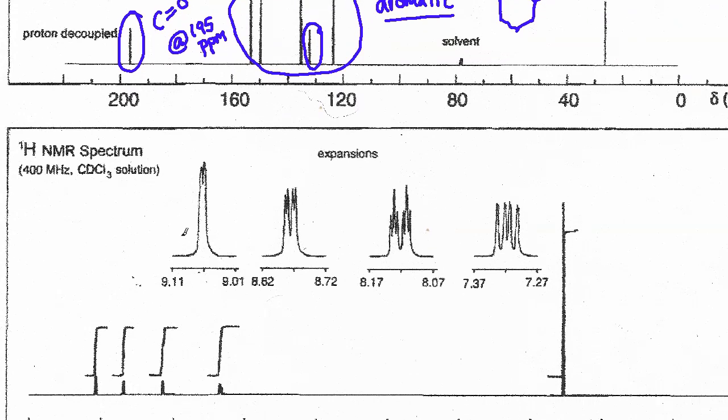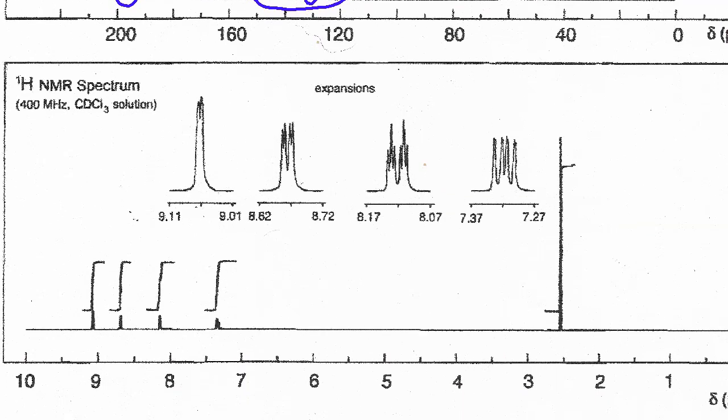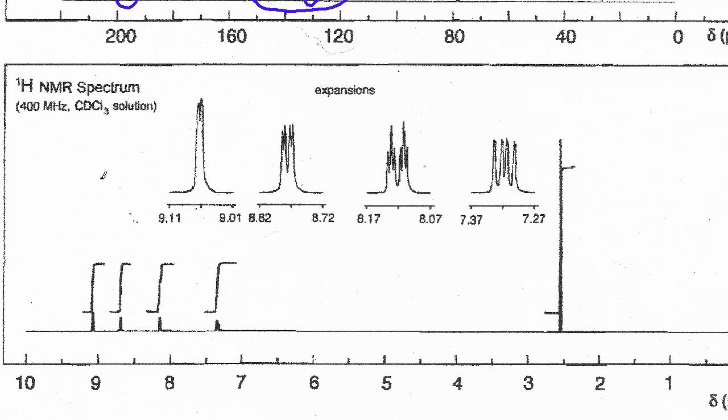So then we come down to the finale. Let me just move my screen down here a little bit because I want you guys to be able to see the ppm scale. All right, so when we come down here, the integration that I'll write here, it's 3, and then these are each 1.